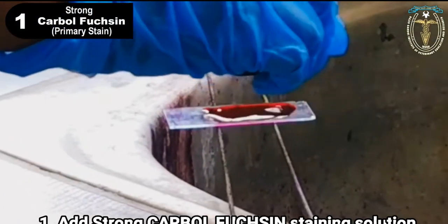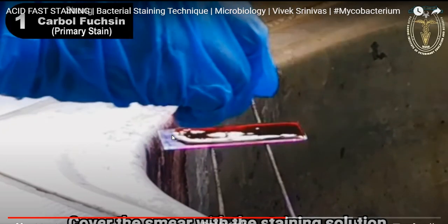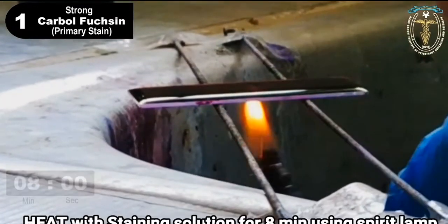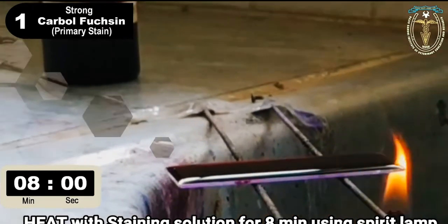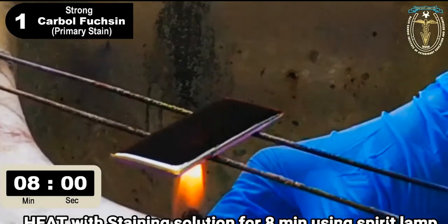After 2 minutes, wash it with the distilled water. Lastly, add the Loeffler's methylene blue staining solution over the smear. Cover the entire smear with the staining solution, and allow it to stand for 30 seconds to 1 minute. After 30 seconds to 1 minute, wash it with the distilled water.